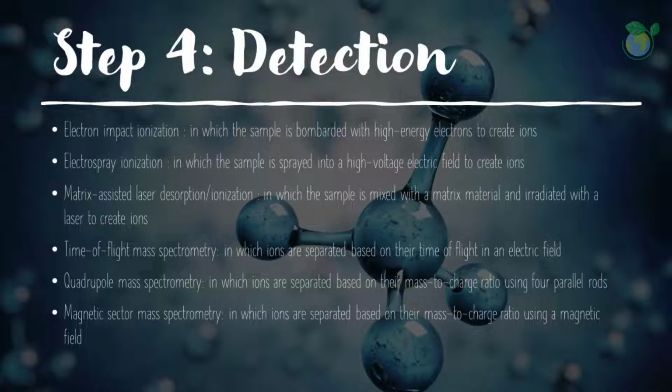Time of flight, TOF, mass spectrometry, in which ions are separated based on their time of flight in an electric field. Quadrupole mass spectrometry, in which ions are separated based on their mass-to-charge ratio using 4 parallel rods. Magnetic sector mass spectrometry, in which ions are separated based on their mass-to-charge ratio using a magnetic field.